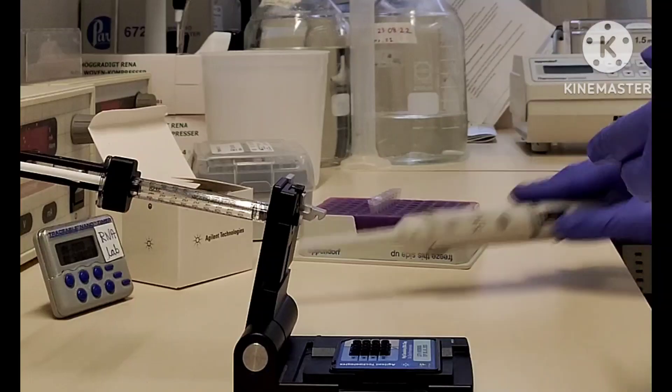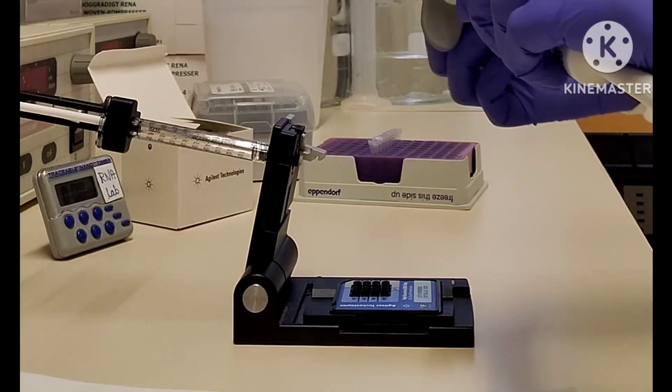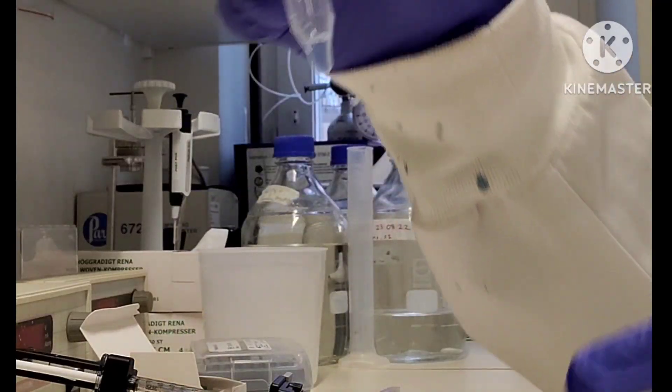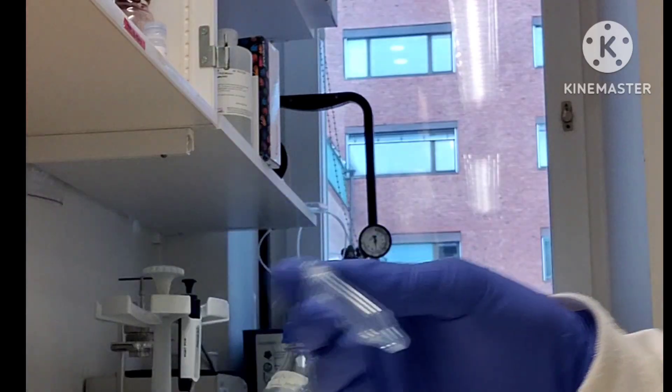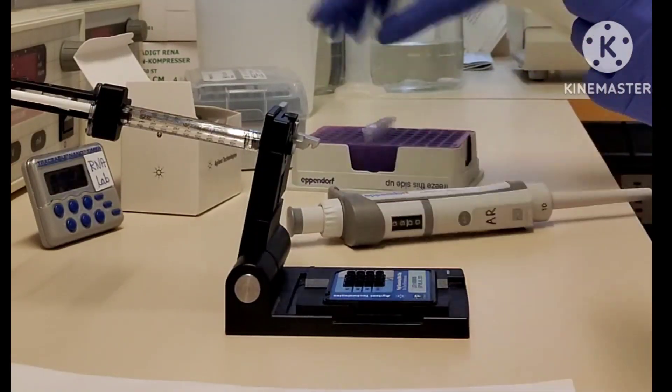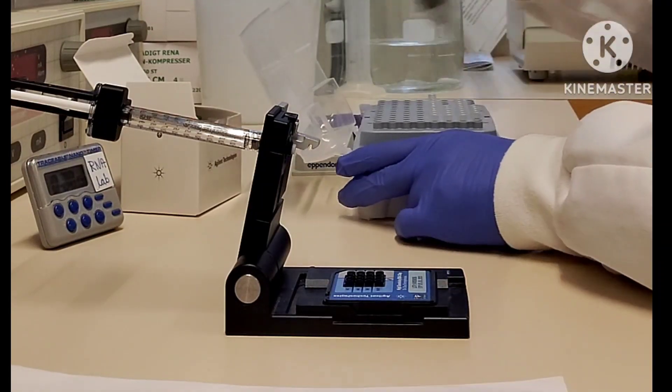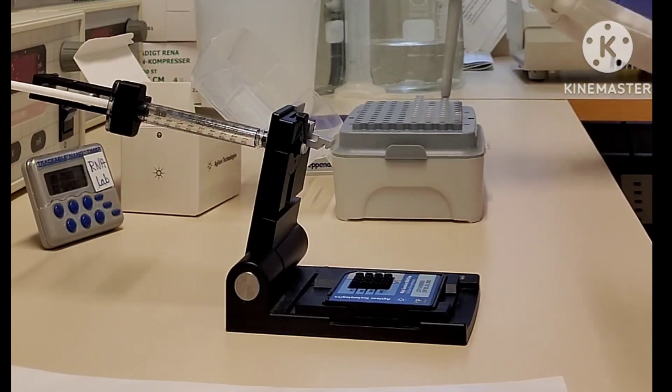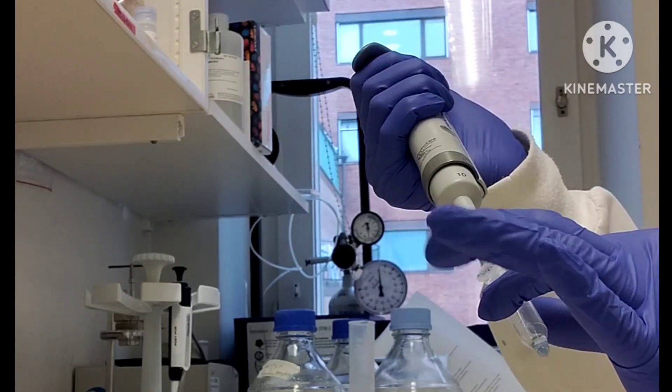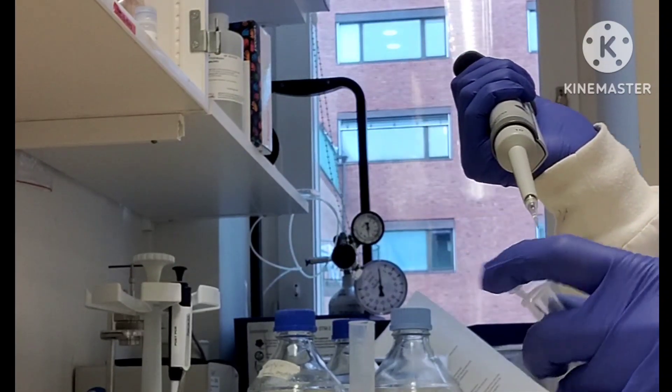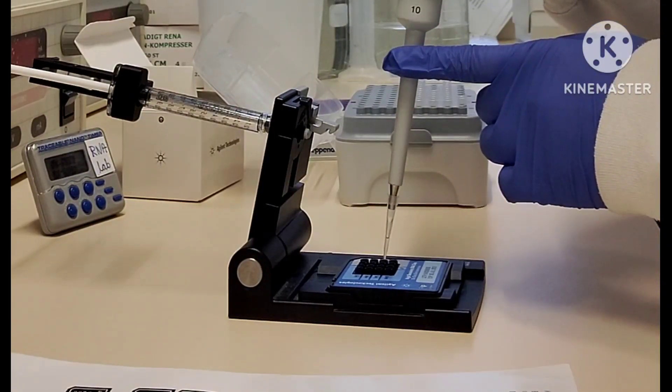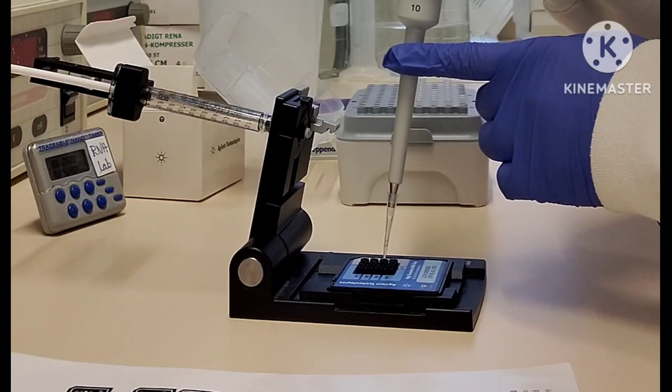Before starting this experiment, take out all the reagents and keep them at room temperature for at least 30 minutes. This is the gel dye which I previously made. Here I want to give a small tip to you all: since the gel dye is very viscous in nature, you can reverse pipette it and always pipette very slowly to take the perfect amount of gel. Add that gel dye in the correct well.